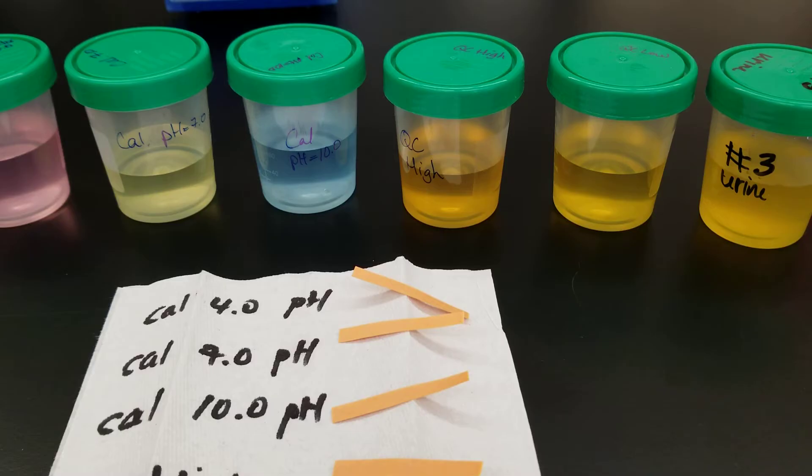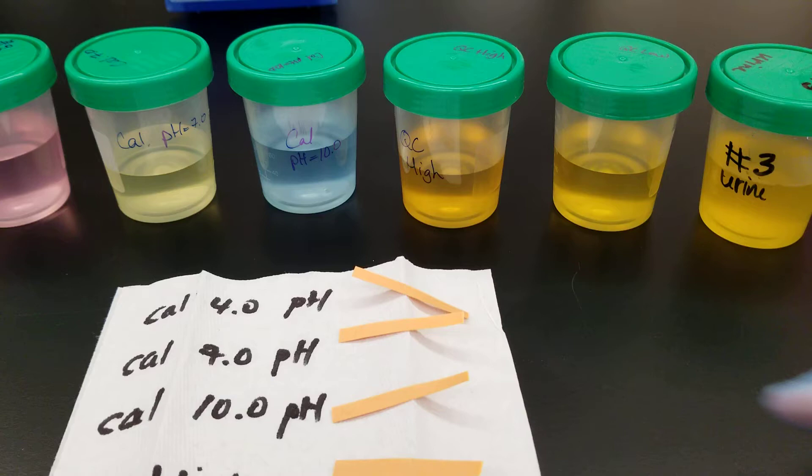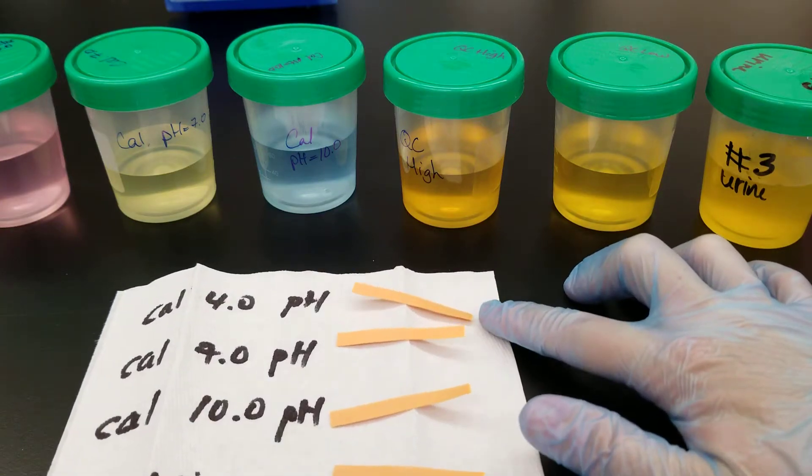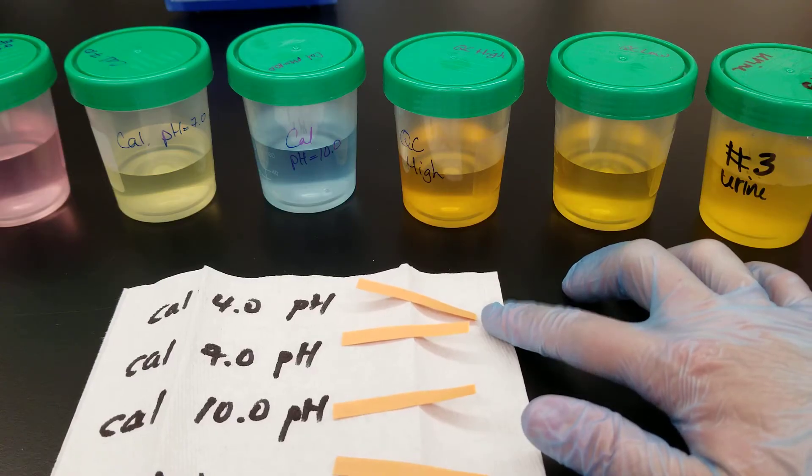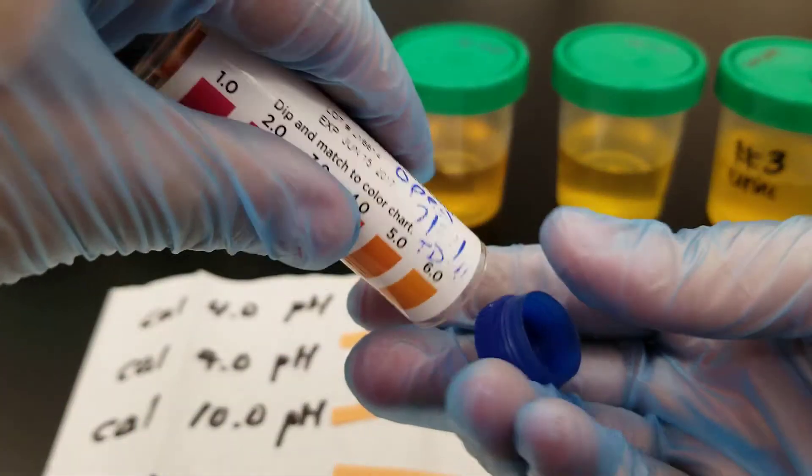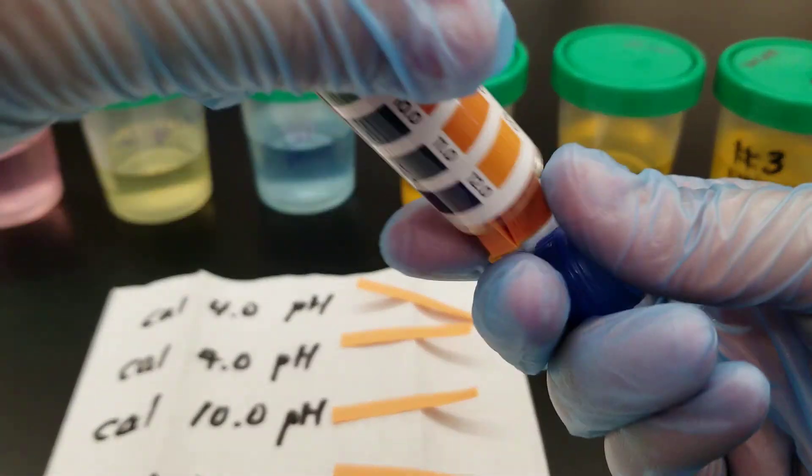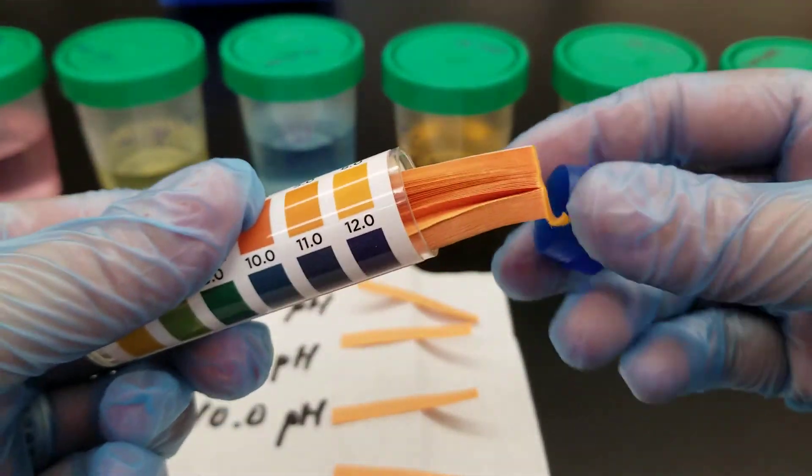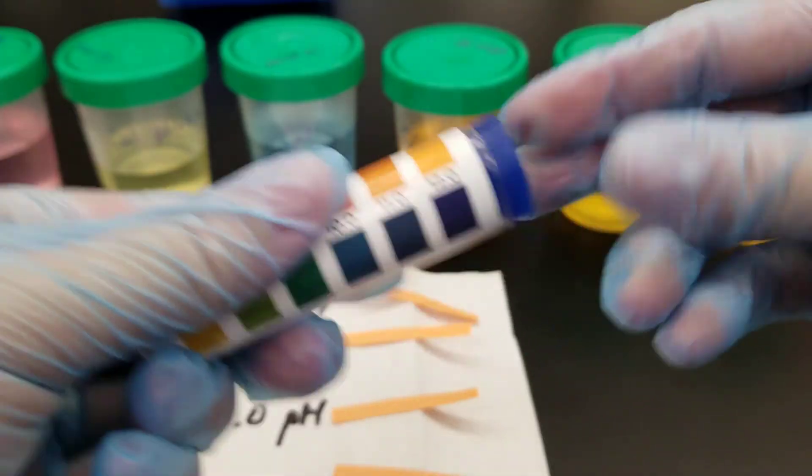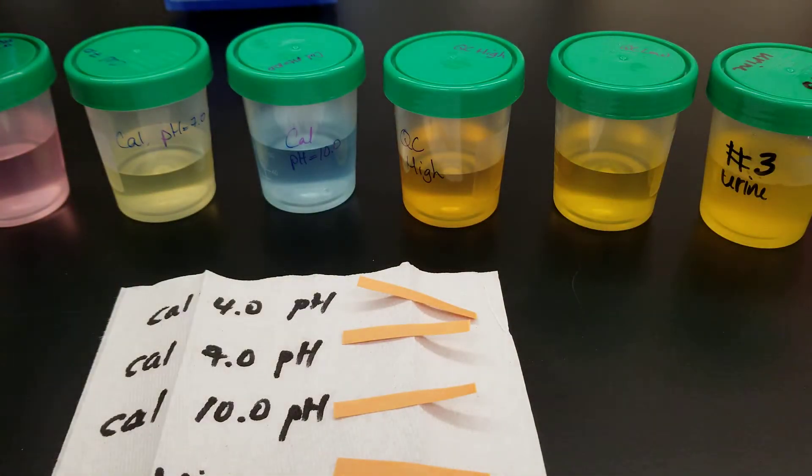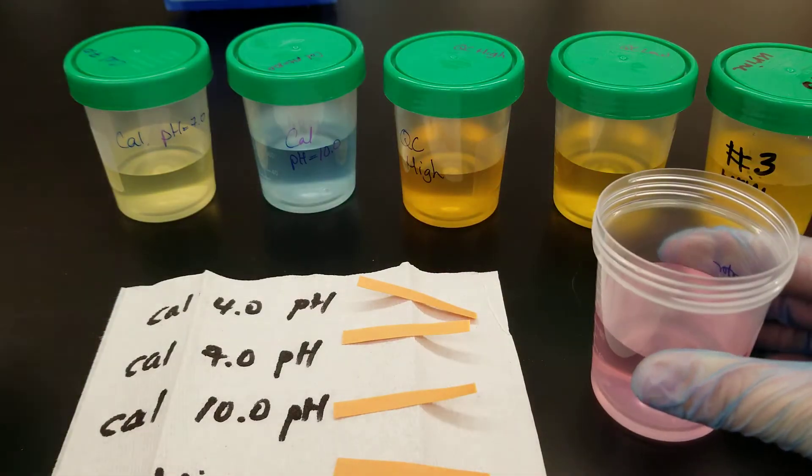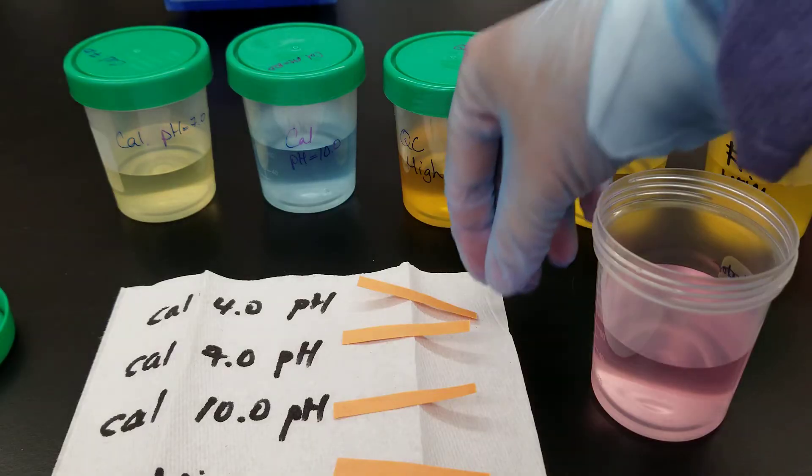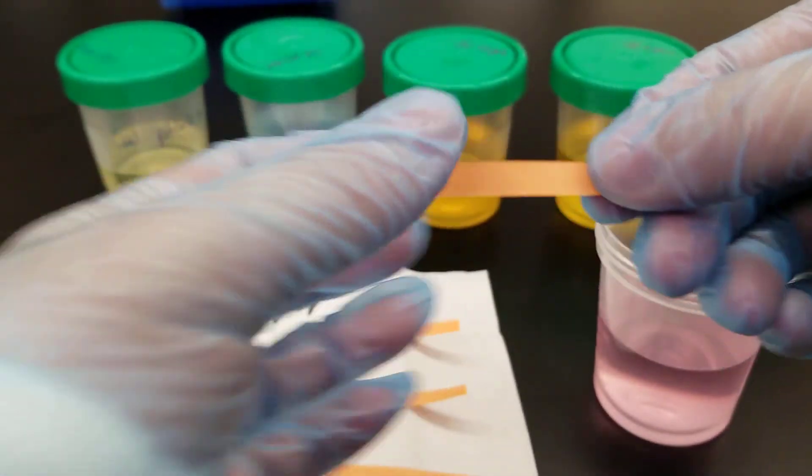We're going to use the pH paper in the calibrators first. I'm right-handed, so I put the side that came off the sticky glue part. I don't want the glue tape to interfere with my measurements, so I'm going to hold that side and dip the other. The first one we're going to do is the pH 4, that's the pink one. You're gonna hold the side with the glue.